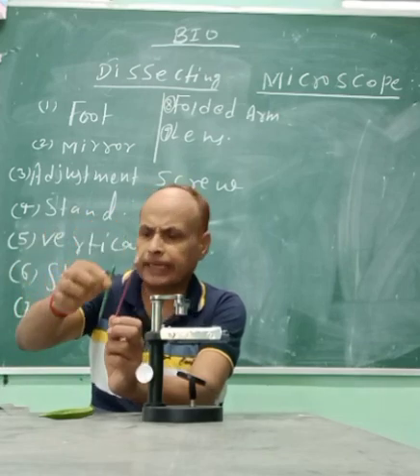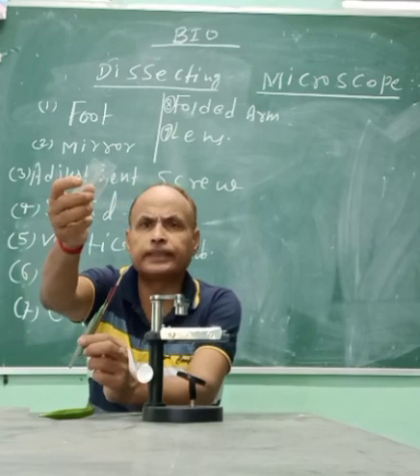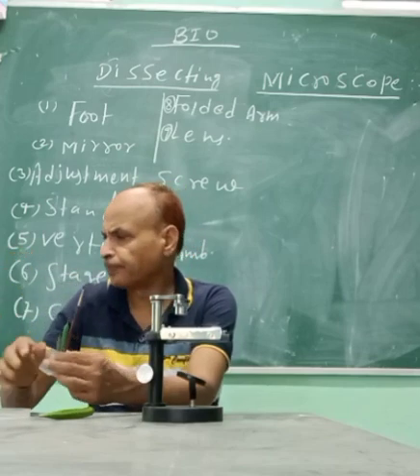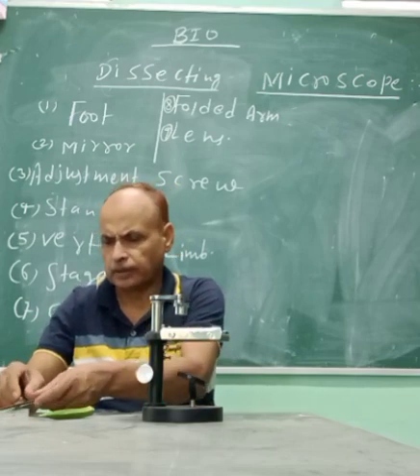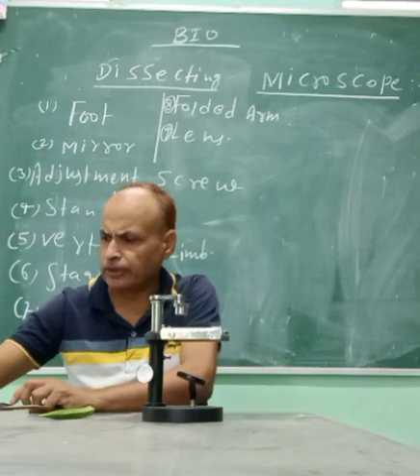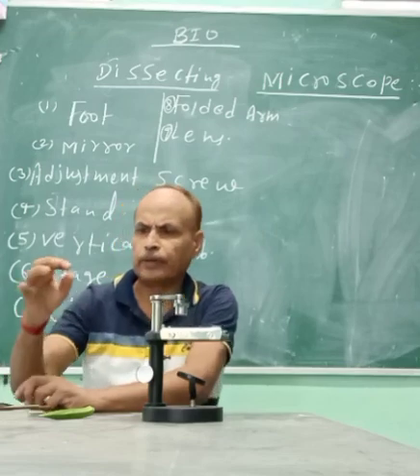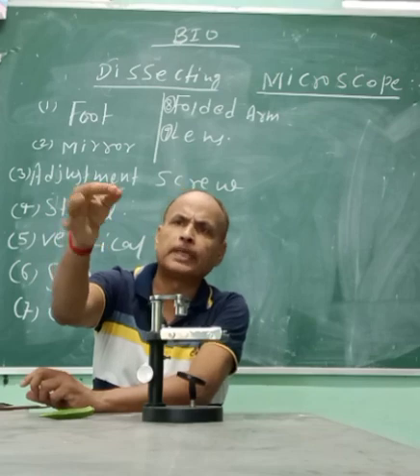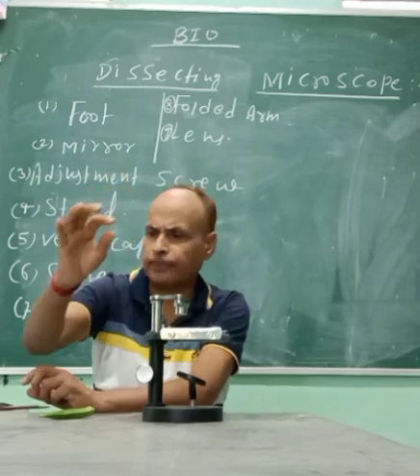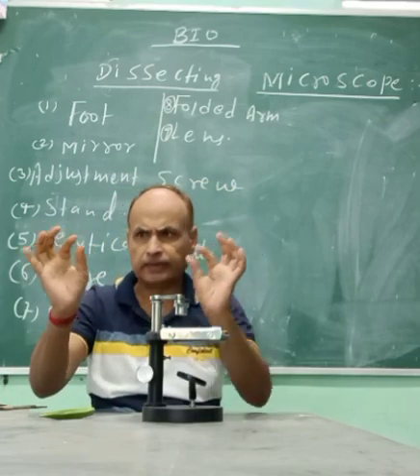This is a brush, and this is a forceps. These are the slides, and this is a petri dish in which water is kept. We need water so that what we observe does not dry out. This small square, very thin piece of glass is called the cover slip. This rectangular piece is somewhat thicker.